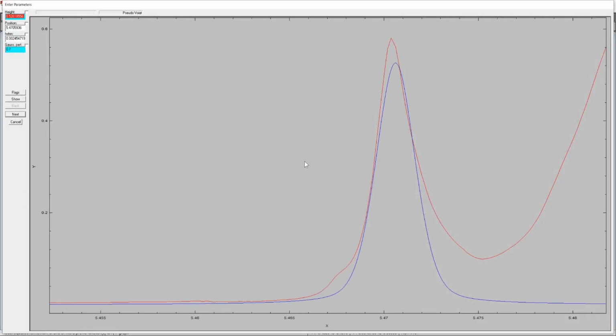And again, we have to input the parameters. Note now that those are the starting values for the symmetric function. There's a certain order in the program in which those profile functions appear in the refinement and also in the selection of starting parameters.